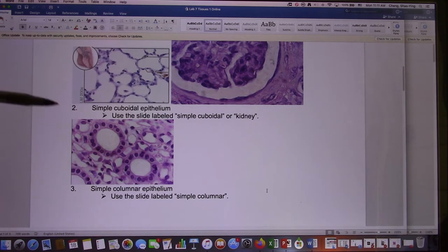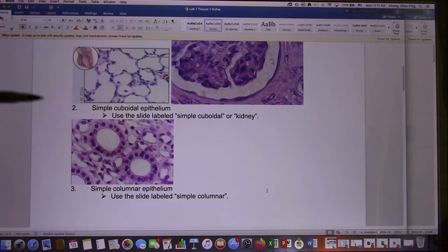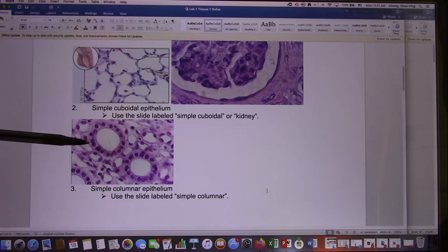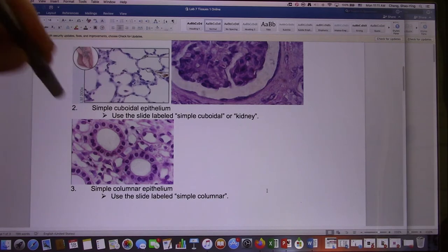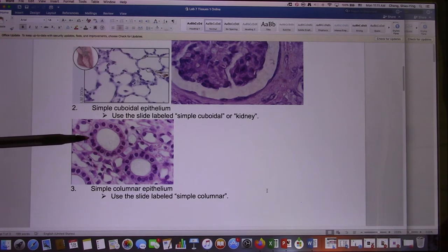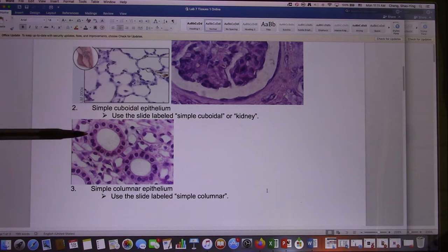You need to know where to look — it takes practice. During the test I will very specifically point at the tissue I'm going to ask you about. These are the tubes in the kidney and they extend out in this direction, so we cut them. This is the simple cuboidal — one layer and it's square/cube shape. Simple cuboidal.